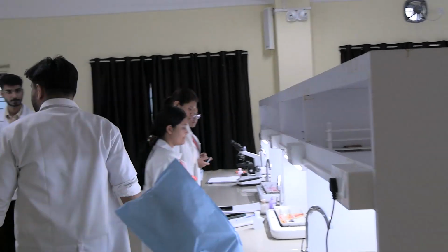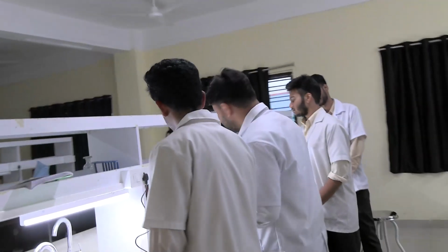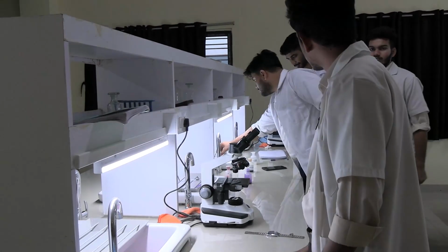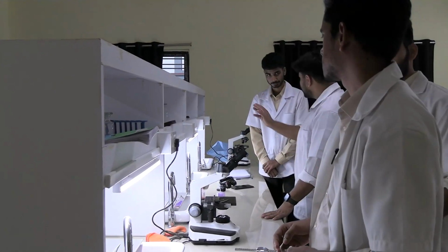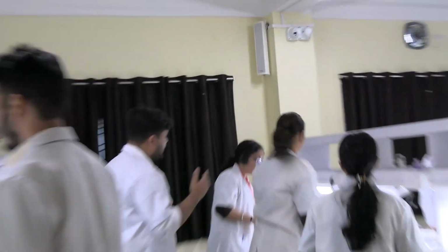Just you wanna wait for some time after the excess water has been. You have done the counterstaining, okay? So what you're gonna do is you're gonna put it in this crevice between the faucet and the basin, okay? So the excess water dribbles down. After the excess water has dribbled down, you're gonna do the air drying, okay?